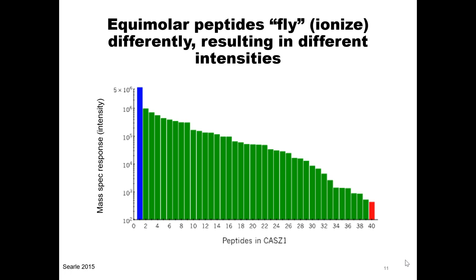And it does not bad, but it doesn't do very well. It's slightly better than if you were to randomly guess ragu, which is why he called it Prego. Slightly better than ragu. Prego is also an external tool in Skyline, so you can install it. But again, he is the first to admit it's not fantastic. So really the best way to tell is just to empirically try.